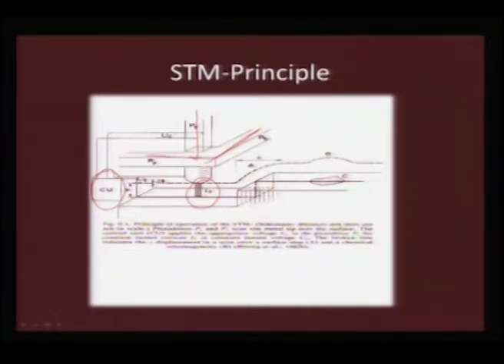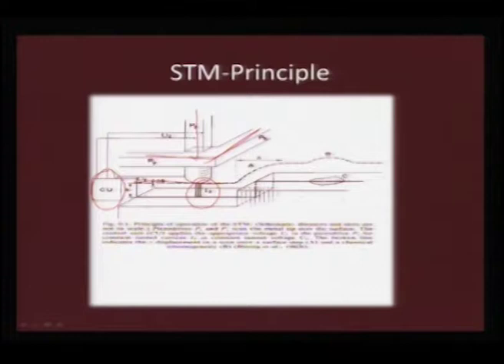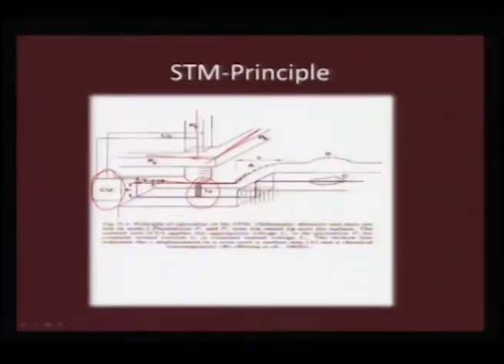And this is the map which tells you what exactly will happen when this piezoelectric table is moving in the XY direction. If this is a flat terrace, then this dotted line will tell you that the surface is smooth. Suppose the crystal has a step edge, then the position of the tip will move this way, and if you see this sort of movement, then you understand that the crystal has a step edge.